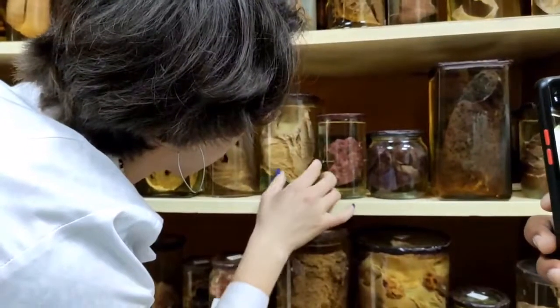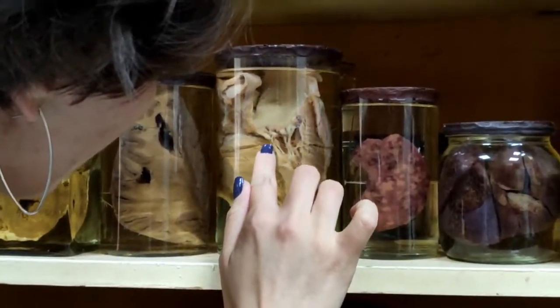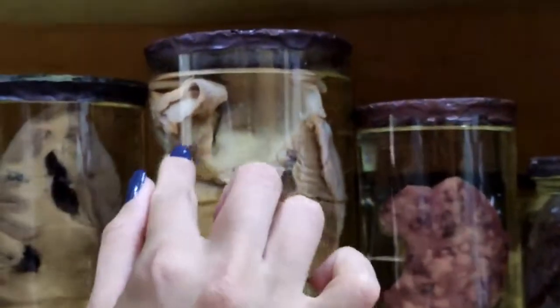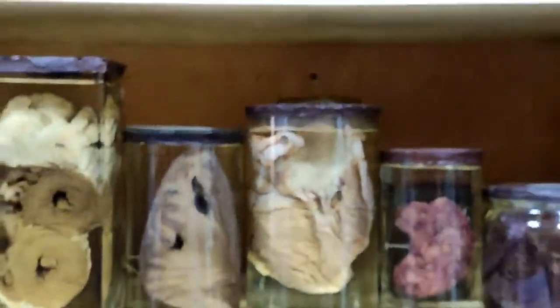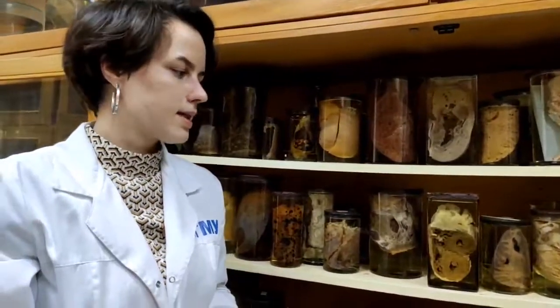Okay, the next one, can you see what is this? Rheumatic endocarditis, and we can see acute verrucous endocarditis, because we have acute verrucous and recurrent verrucous. And verrucous means that we see a lot of granulomas on the surface of this valve. Can you see? Something like nodules. It's really difficult to differentiate between acute verrucous and chronic verrucous, but you should just know these types of endocarditis in rheumatism in theory.